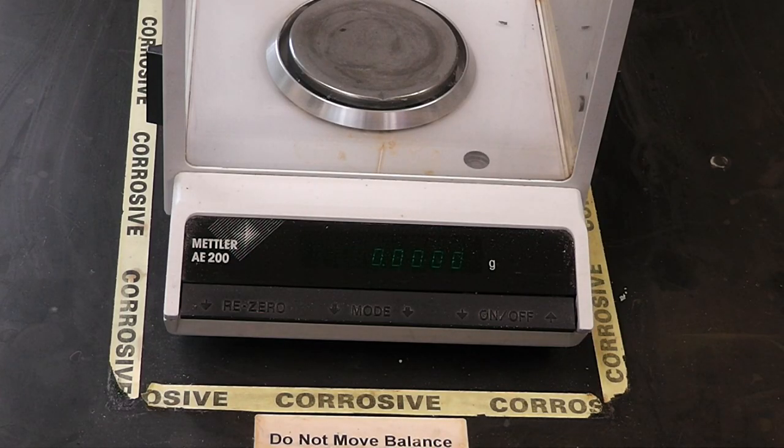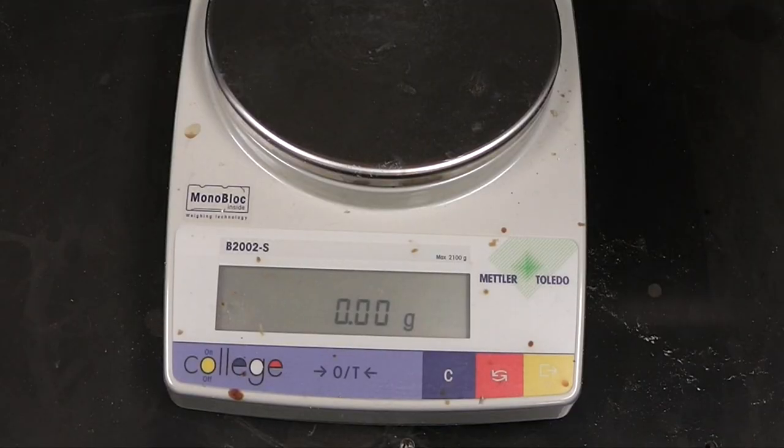In layman's terms, the main difference between the two is that the analytical balance can measure to four decimal places, as seen here, while the top loading balance can only measure to two decimal places.